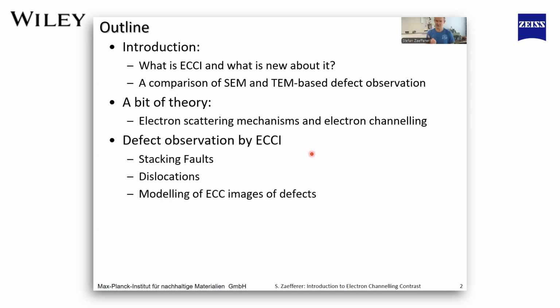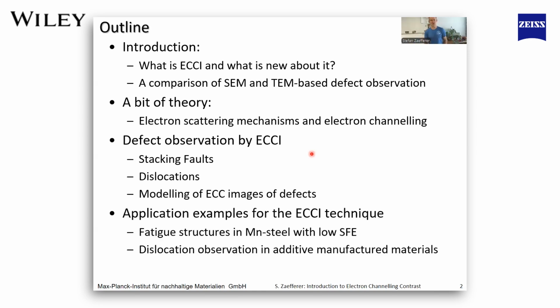I'm then explaining how we see defects by ECCI, meaning stacking faults, dislocations, and a little bit how we model, or how we could model defect images. And then I will show a couple of examples from different materials and finally conclude.